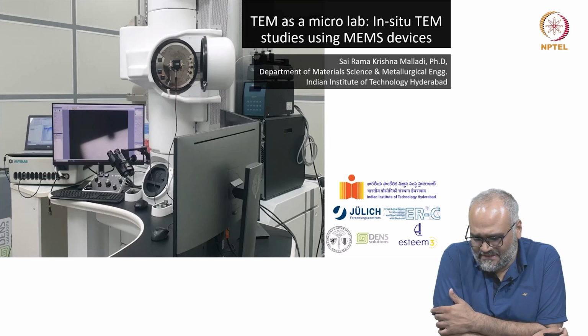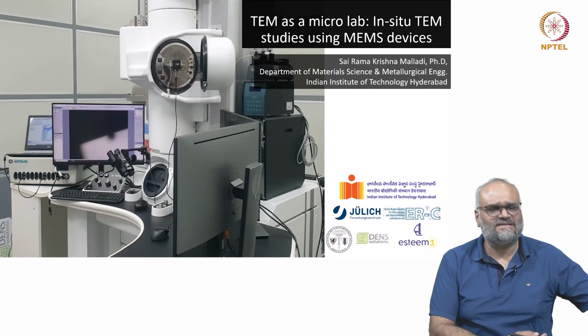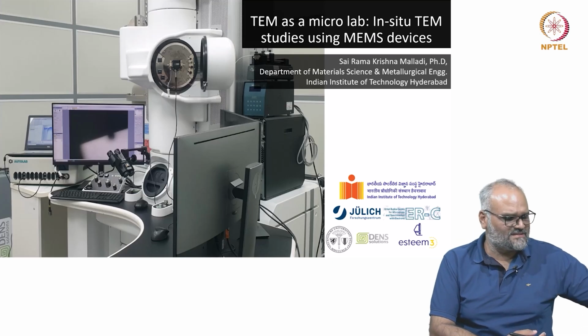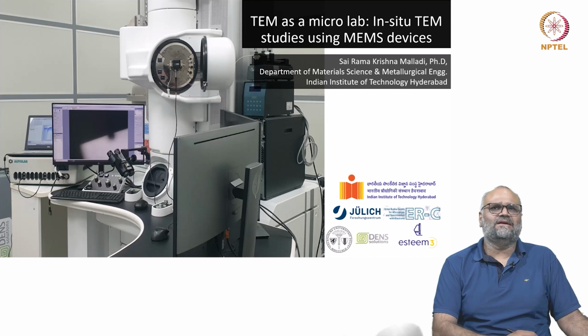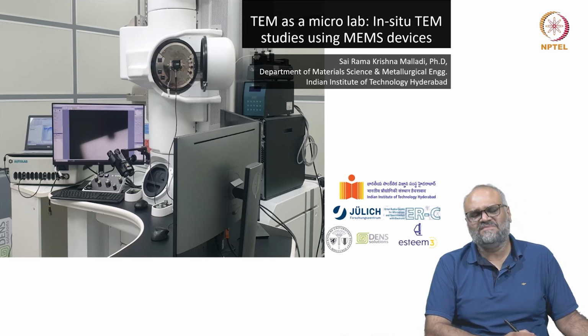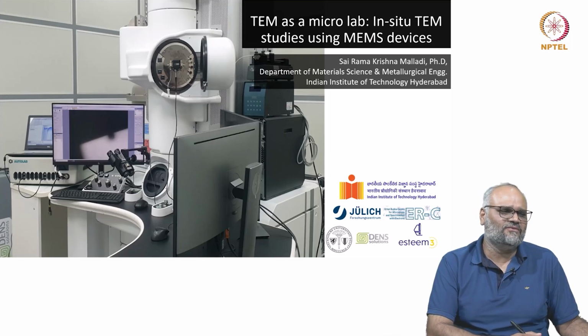And these were prototypes which were developed long ago, and they are now available as commercial products through DENSsolutions also. So let us have a look at what this interesting area of in situ electron microscopy is, and how MEMS devices can help you plan experiments which are very interesting and you can only dream of.